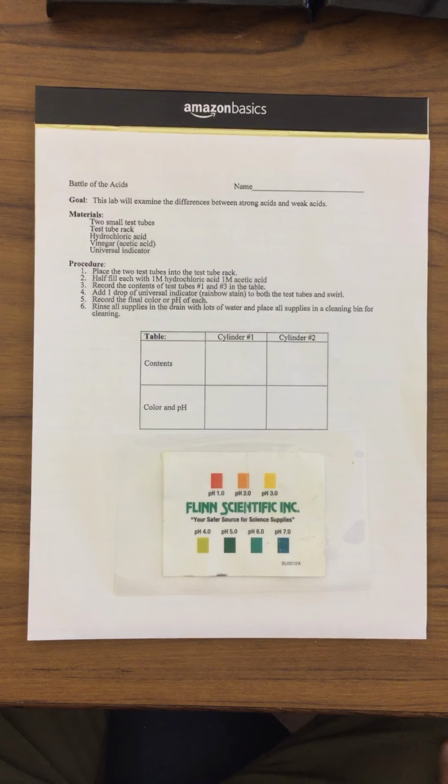What is the color and the pH? The color of the first one was reddish. And remember, the second one was yellow, yellow-orange. We'll just say it was yellow. There's a definite distinction between the two. What was the pH of the first one? Well, according to this chart right here, the pH of red is going to be 1. So we'd say the pH equals 1. And over here, the pH for the yellow is going to be equal to 3.0.